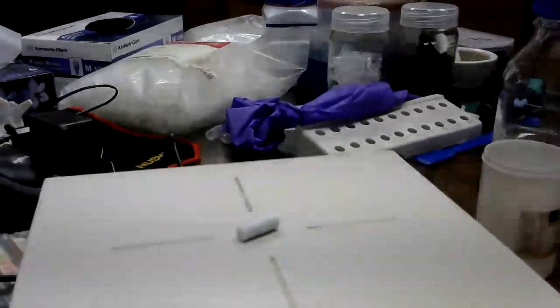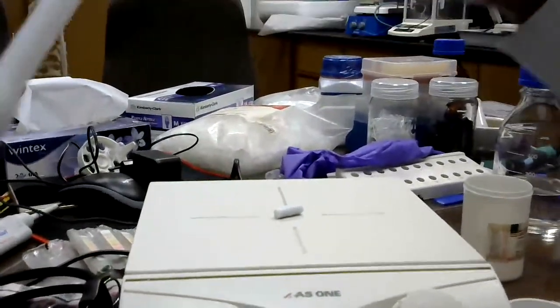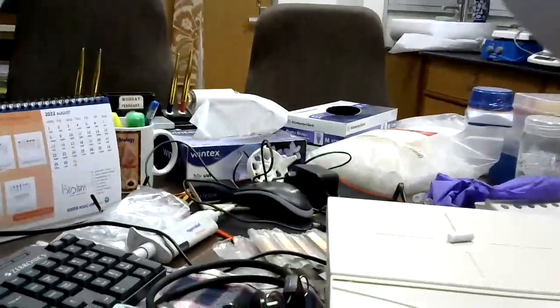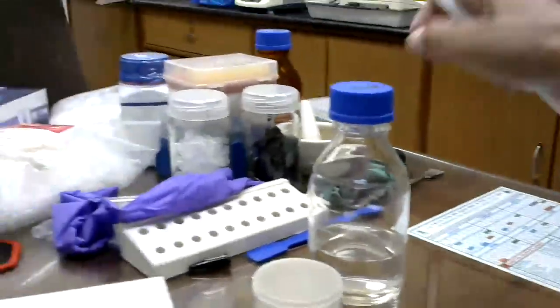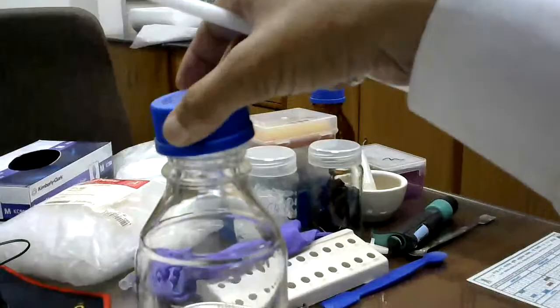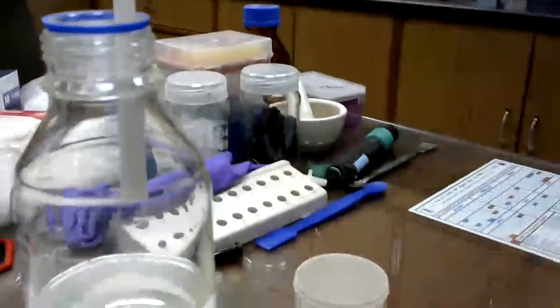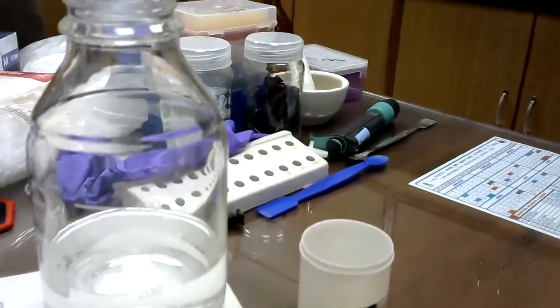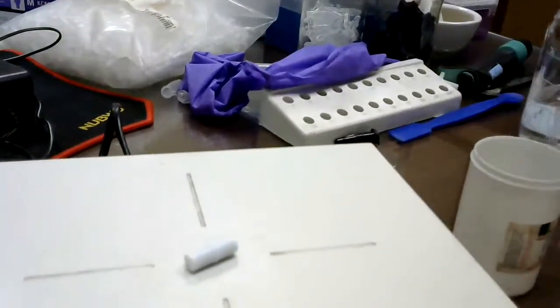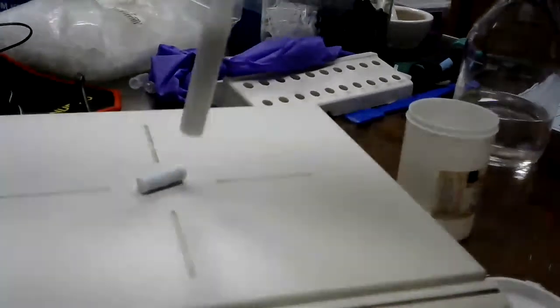Okay. So what I can do, this is one policeman, this rod. I will open this bottle and put this rod here. See, going inside, and it will go down. So that I am going to show you. This is acetic acid solution, so we cannot keep it open for a longer time. So like that.